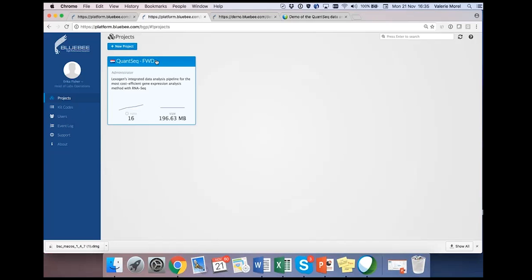Maybe you have mentioned this before. If I use multiple barcodes corresponding to one sample, how can I specifically define this in the analysis settings? So far, you cannot.